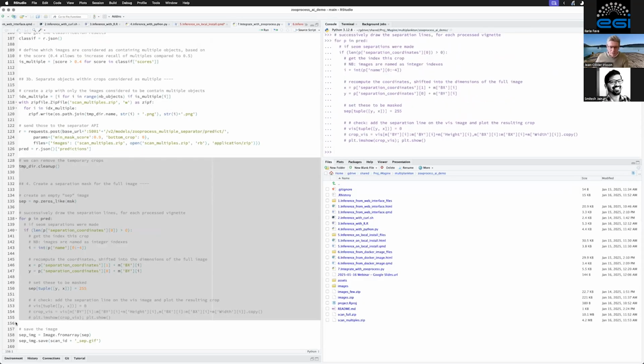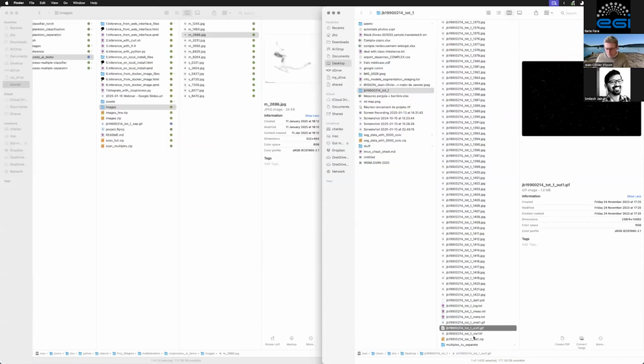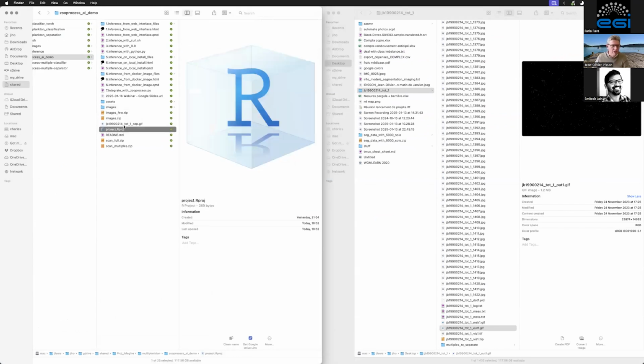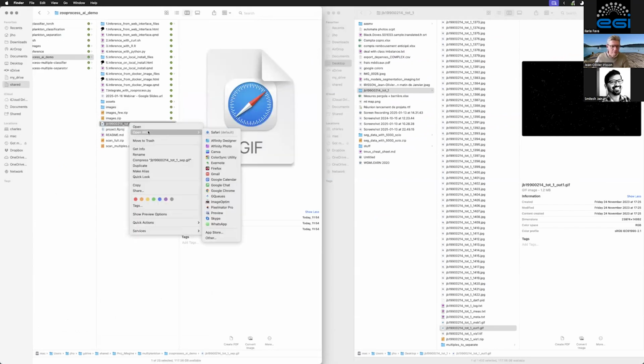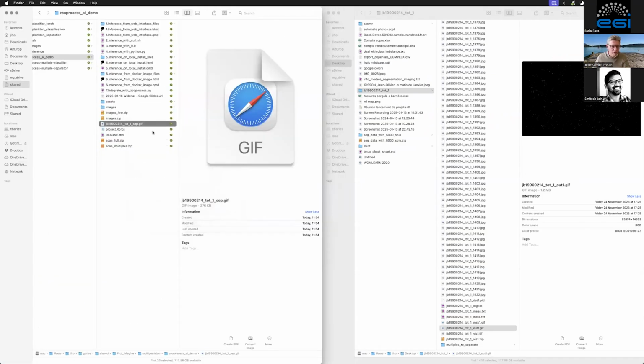And then I've created the image and I saved the image, okay? It's there. So it has appeared here. Does it work? No, I don't think I can open it this way. Anyway, this is an object that is pure black and with some white squiggles, which are the separation line. And again, this I can put back into the project and let ZooProcess do the rest.